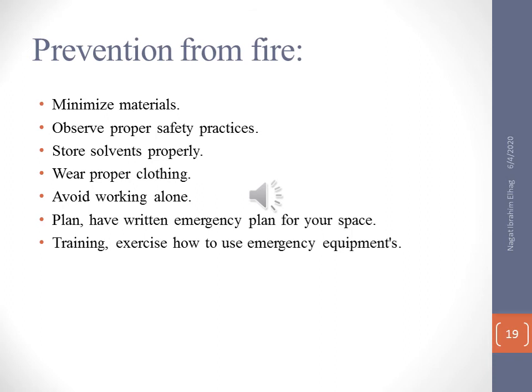Also, store solvent in a proper way, because solvent, as you know, has the ability to dissolve other materials, so you have to avoid the risk that may result from those solutions by storing them in a good way.